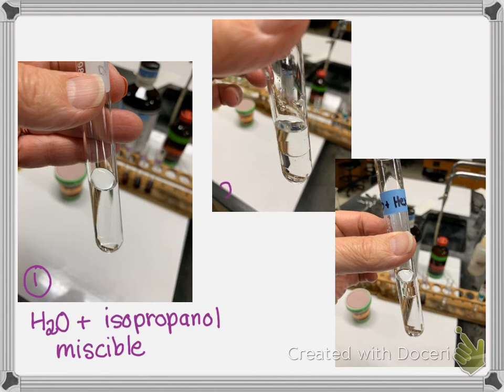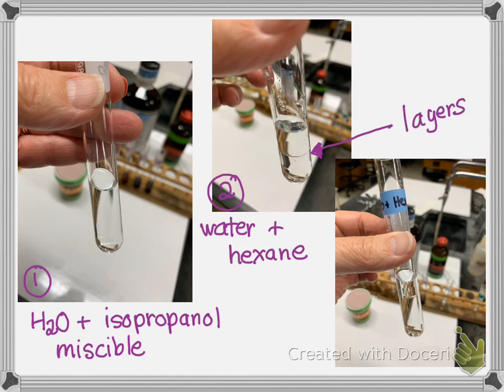And this is test tube 2. And this was water, which is polar, and hexane, which is nonpolar. And if you look right there, it's like oil and water. There was a layer. So these do not mix. They form layers, and it's kind of hard to see with 2 colorless liquids, but there's a little layer in between, like oil and water. And so this we would say is immiscible.